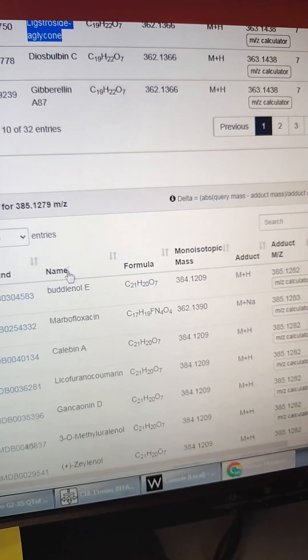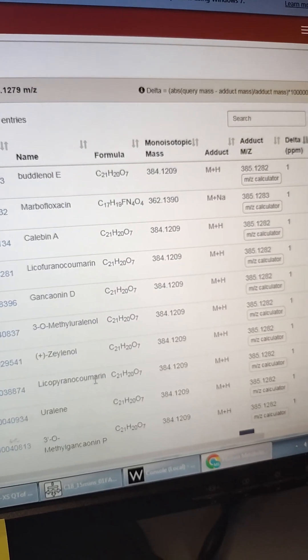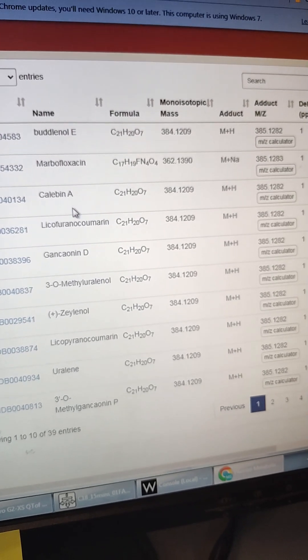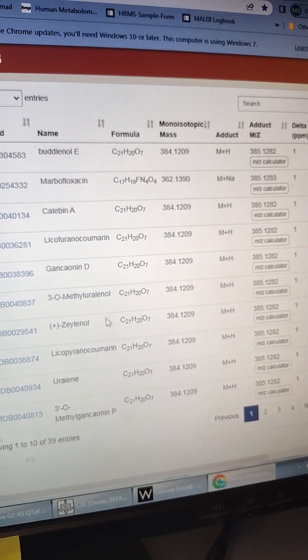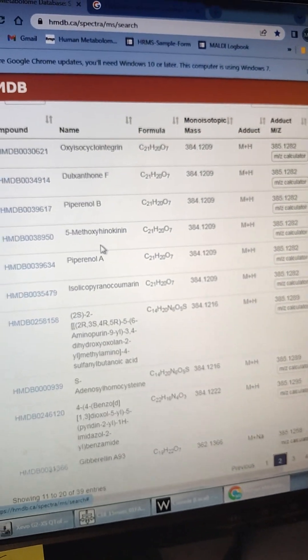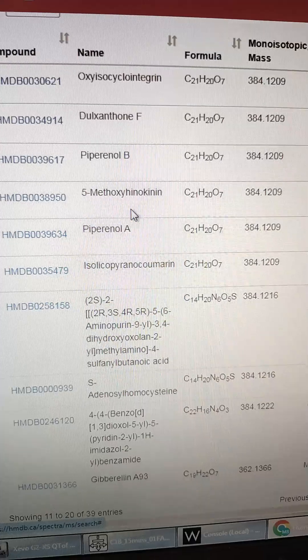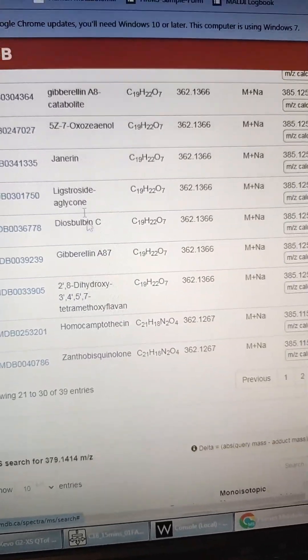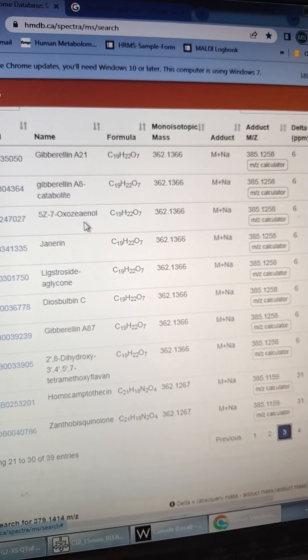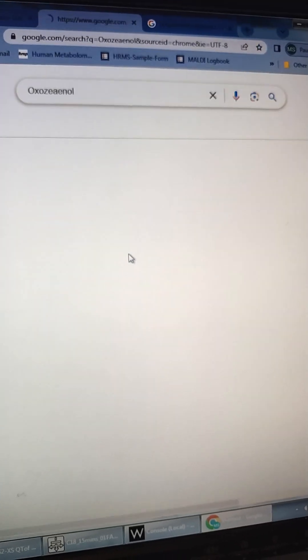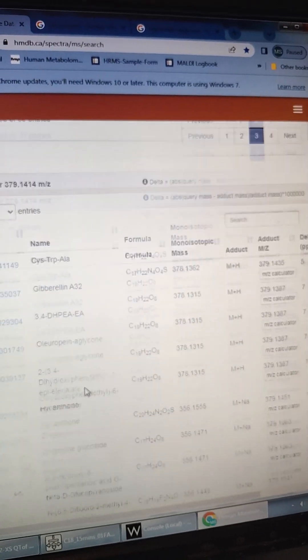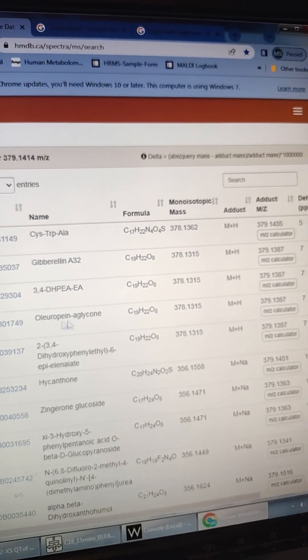So then the next thing we got here. Boy, there's a lot of stuff. I couldn't guess which one this is. We're definitely going to have to send this through MS-MS. Take a look at maybe the next. Anyone's got a clue? These are gibberellins as well, potentially. Gibberellins are plant hormones that could be used here. We got another aglycon. This is the oleo. This is another probably olive oil. Olive oil cultivar aglycon. Man, there we go. We're really doing a good job here.